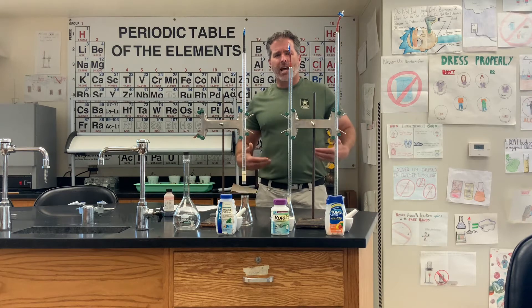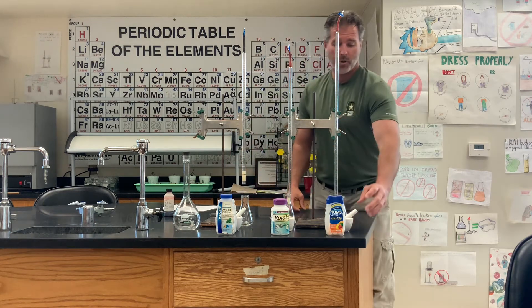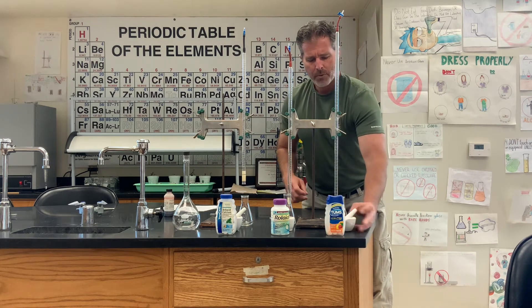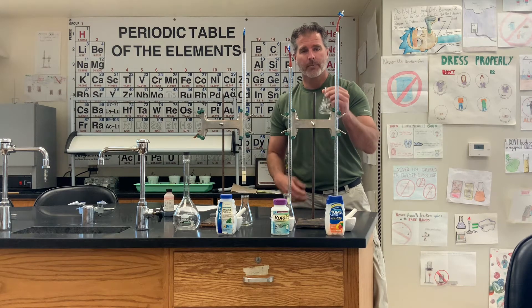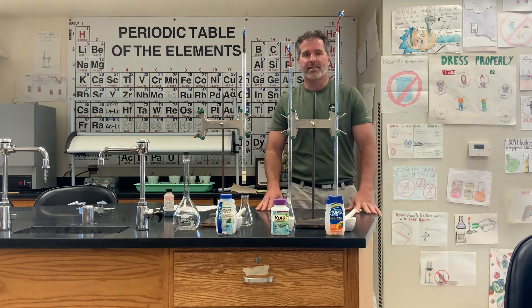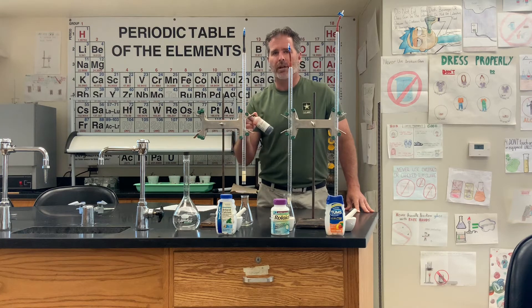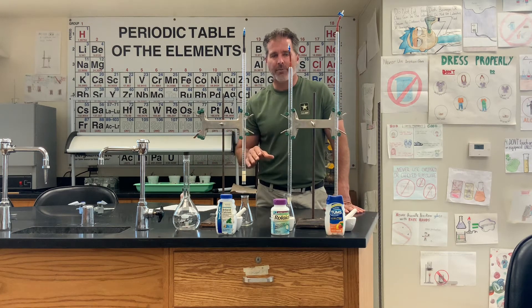Kind of like the same process that would happen in your stomach. I'm going to use a mortar and pestle to crush and powder the tablets, put them in an Erlenmeyer flask, add about 50 milliliters of distilled water to simulate your stomach, and then add the acid. When the indicator goes from red to blue and persists for about four to five minutes, then we've reached our end point.